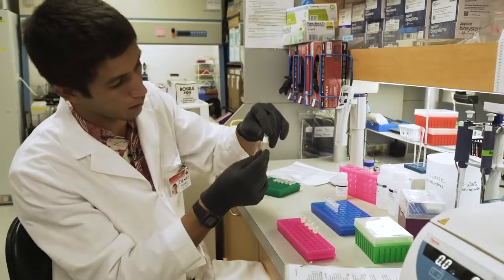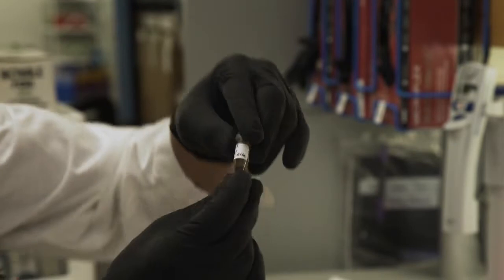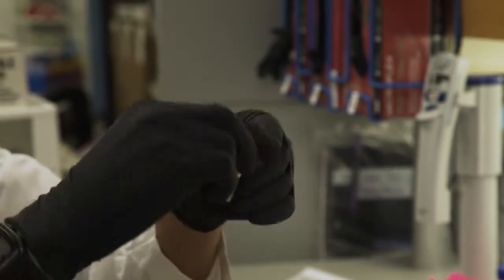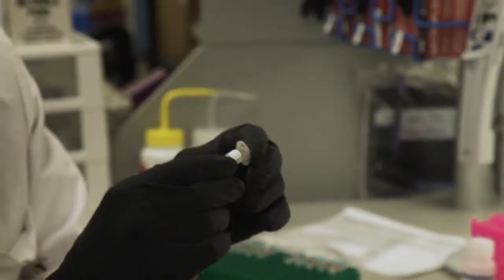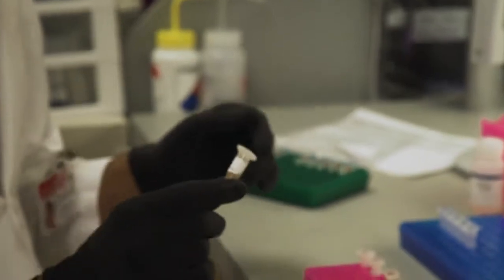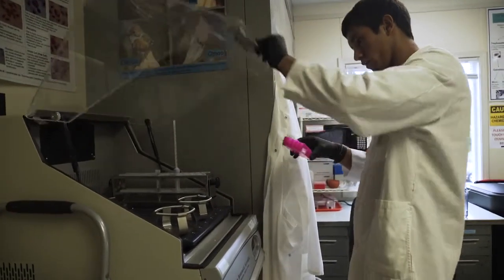When you saw them before, they all looked more like this. Although this one, if you look closely, is kind of more turbid. It has all those white flecks in it. And there's this one, which very clearly has a lot more white flecks, and just a lot of junk in it. It's not 100% that this will happen. It depends on what part of the slug got snipped and a lot of different factors. When this does happen, we have to reheat the samples. So we'll stick these back in the incubator for another 10 minutes or so till these have dissipated.